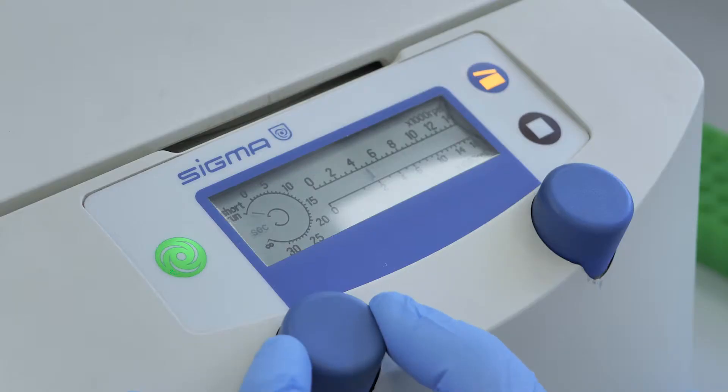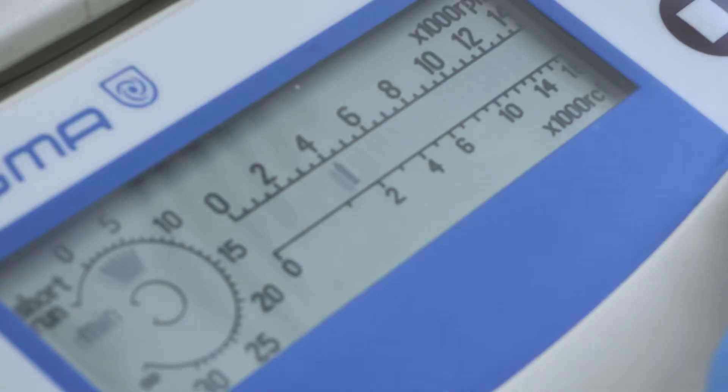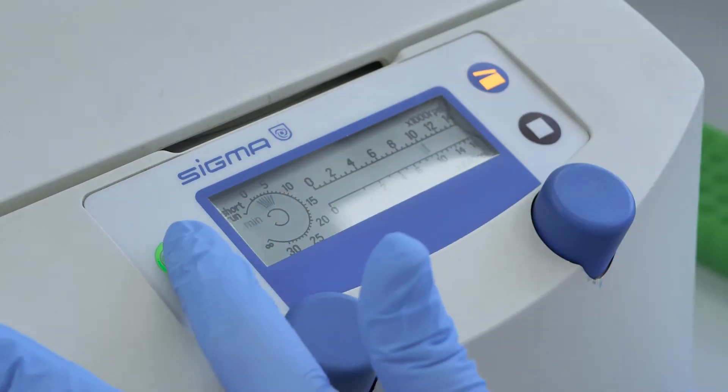Set the time for the spin. Set the desired rotations per minute (RPM) or relative centrifugal force (CF). Press the green start spin button.